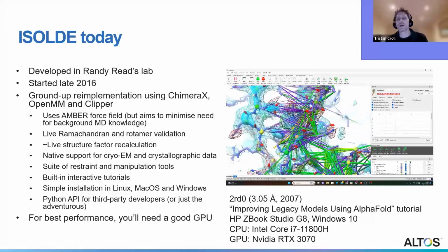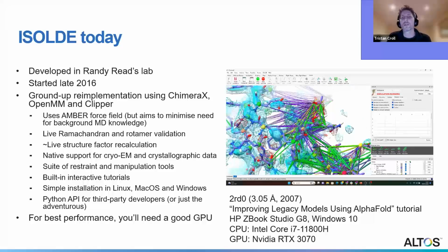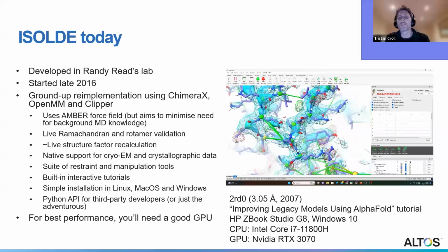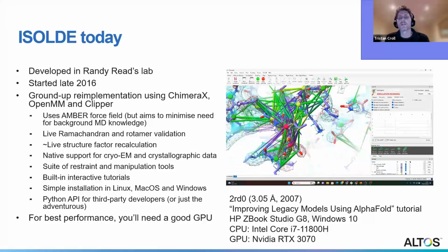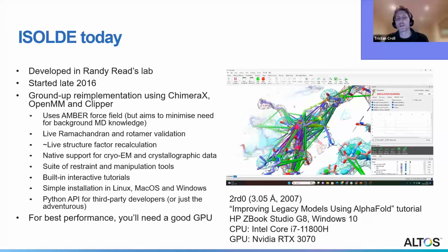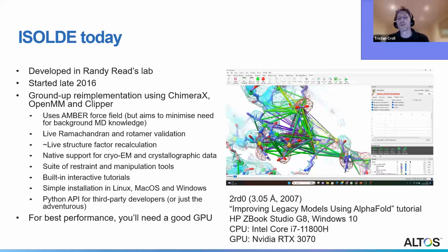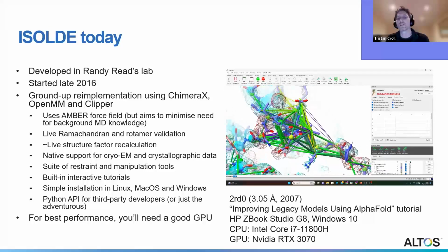Similarly, as Paul mentioned in his talk, one of the things I did fairly early on was dive into Clipper's structure factor calculation code and work at parallelizing some of the bottlenecks in it across available CPUs and pushing everything into a background thread, so that now the maps can just keep on updating in the background as your model changes.